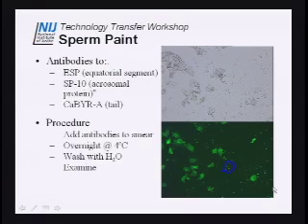Can you imagine how easy it would be to search that whole slide and look for those bright spots, as opposed to searching the top slide? That's the same slide, the top and the bottom. One's taken in bright field, the other's taken in fluorescence. Most of the time when I search them, I search with the 40X objective. With this fluorescent sperm ID, I can drop down to the 20X objective and search the slide just as easily with the same confidence.